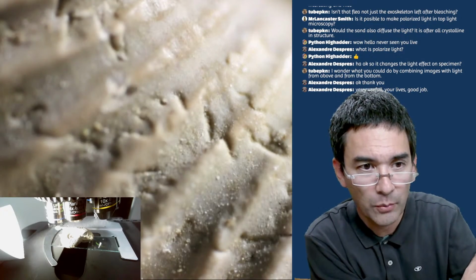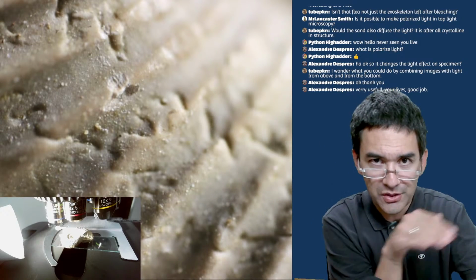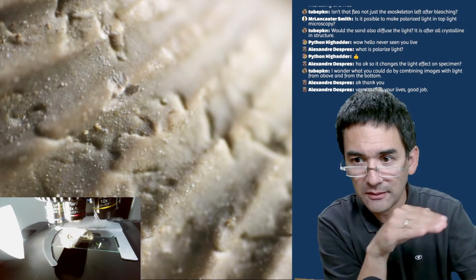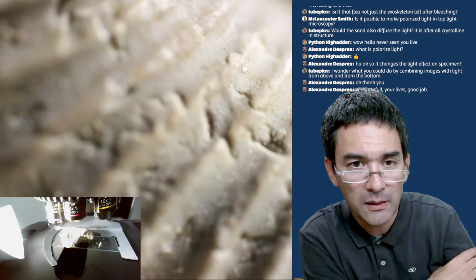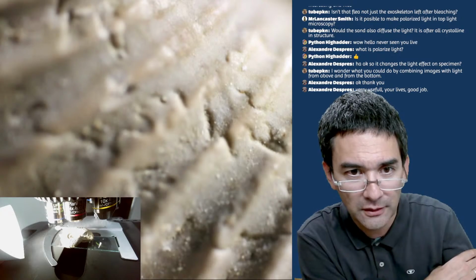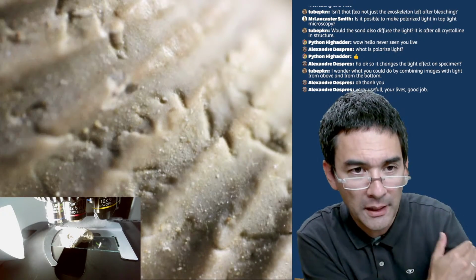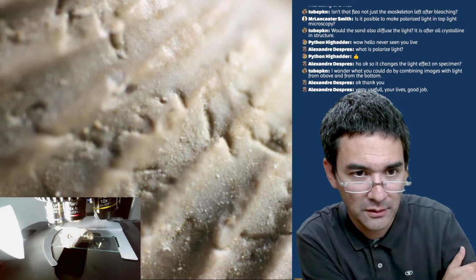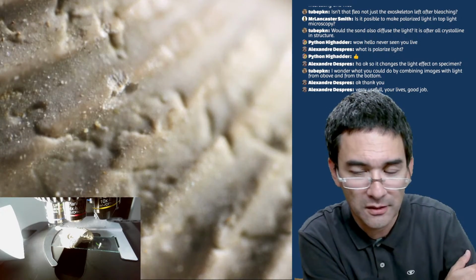I mean, that's one of those examples where you see that not everything is in focus at the same time because the specimen is slanted. Okay, and therefore this would be a classical example of doing some stacking. So you take, I don't know, 10 pictures at different focus, and then you combine them into one. So there are plenty of things for hobby microscopists to play around with.